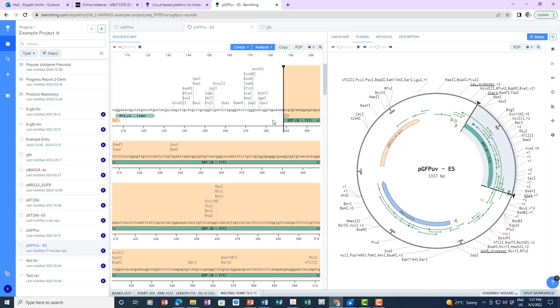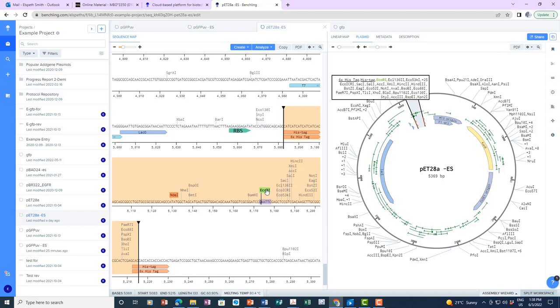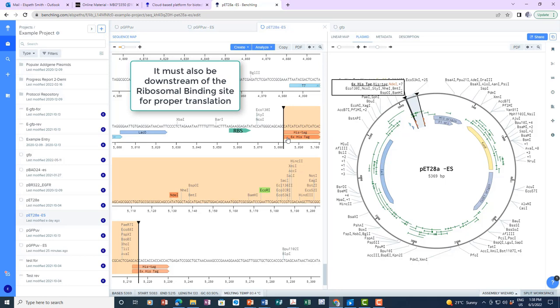So the other factor we need to consider is whether or not these sequences already exist within the PET28A multiple cloning site. So I can open up this plasmid sequence. So of course, there's our EcoR1, that's great, but I really have somewhat limited option in terms of the upstream restriction sequence. Remember that we do need to pick restriction sequences that are downstream of the T7 promoter and LAC operator here, but we also need it to be downstream and in frame with this HIS tag because we want to fuse our 6 histidine residues to our expressed protein. So we're really limited to just these few here.